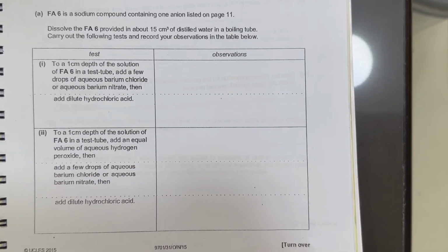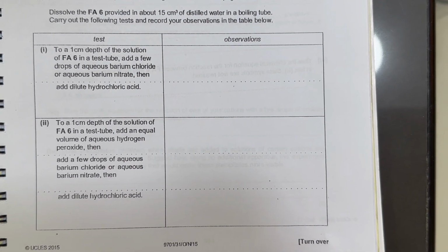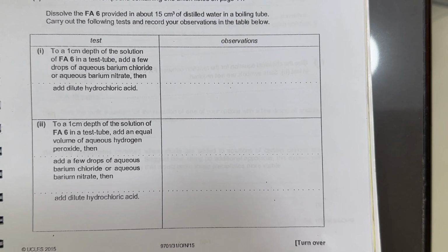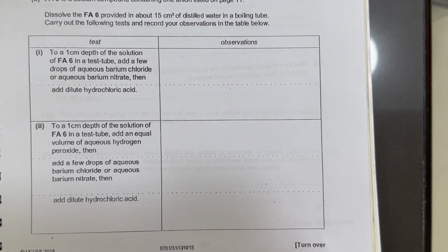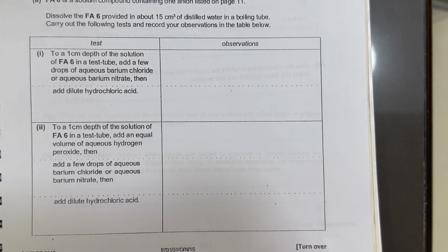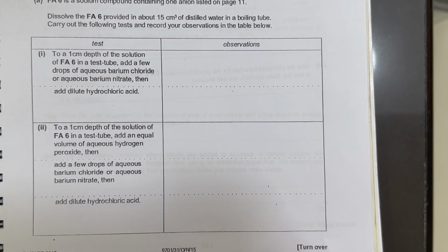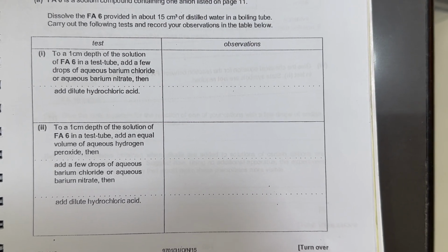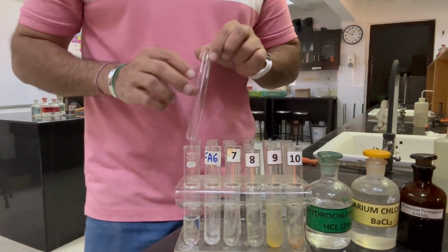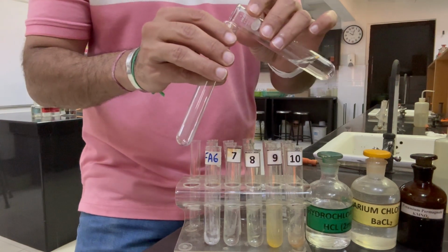In the next part, they have said to a 1 cm depth of the solution of Fa6 in a test tube, add a few drops of barium chloride or barium nitrate, then, and there is a dotted line in between, it means in the same test tube, add dilute hydrochloric acid. So let's perform this test.